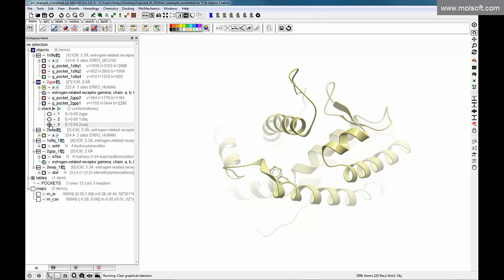And hopefully those would be diverse structures, so you'd have one with the loop in or one with the flexible residue in and out, and what have you. But if you had 10, obviously you'd read 10 structures in.